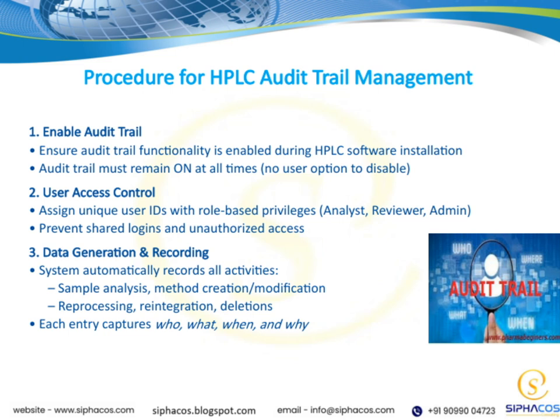Finally, the system itself takes care of recording all activities automatically. This includes sample analysis, creating or modifying methods, reprocessing, reintegration, or deletions. Every entry logs who performed the action, what they did, when they did it, and why, providing a comprehensive trail for accountability and compliance. Together, these steps form a robust framework for audit trail management, ensuring data integrity and regulatory compliance throughout your HPLC operations.